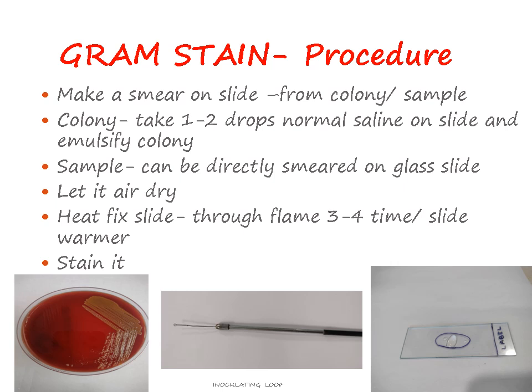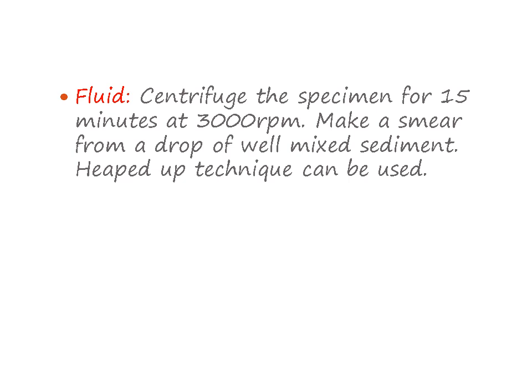This step is important. Why is it important? Because if you don't heat fix the slide, your smear will wash off. The bacteria will wash off while you are doing the staining. So heat fixing is important. Now once your slide is ready and heat fixed, you have to start the staining procedure. Let's see how we will do this. If you are using a fluid specimen, then since the concentration is very low, you need to centrifuge this specimen and use the sediment, that is whatever is settled at the bottom. You just use a drop of that bottom sediment to make the smear.